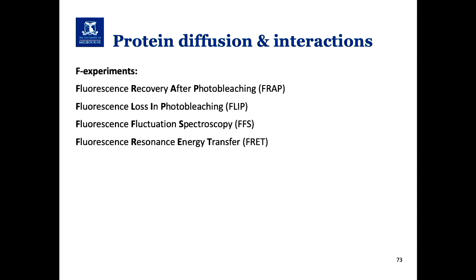Okay, next thing we're going to go through are what we call the F experiments. These broadly look at protein diffusion and protein interactions, and there's a number of different F experiments. You'll find microscopists love an acronym, so everything has its own different acronym.